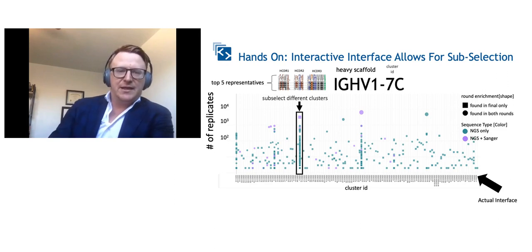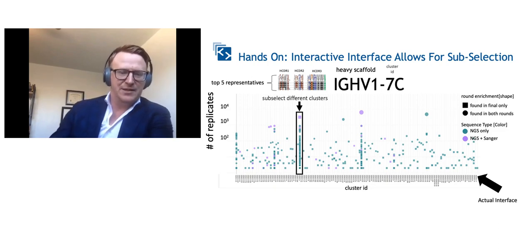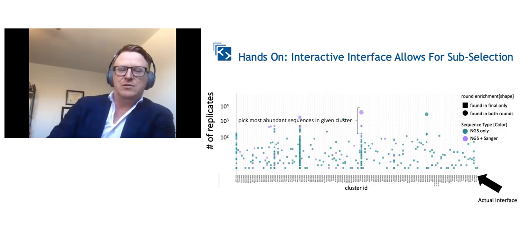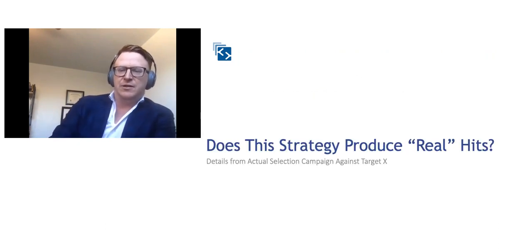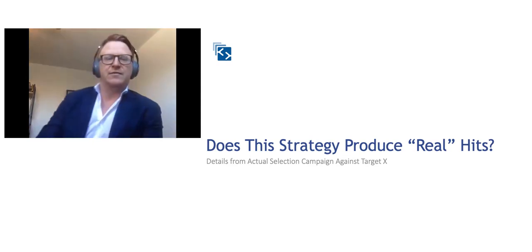And so we can easily select here and choose the most abundant, and green would be some clusters or sequences we haven't explored before. If this was a characterized cluster that had a lot of favorable features in downstream characterization, we can then choose diversity here in additional sequences that may be useful. In addition, we can go across the cluster groups and choose diversity across there, and that enables us to explore this more efficiently and effectively.